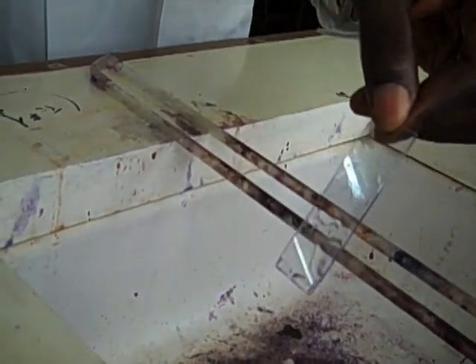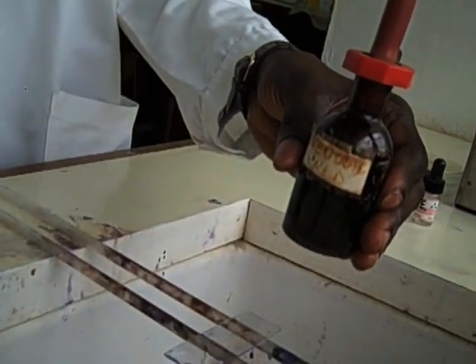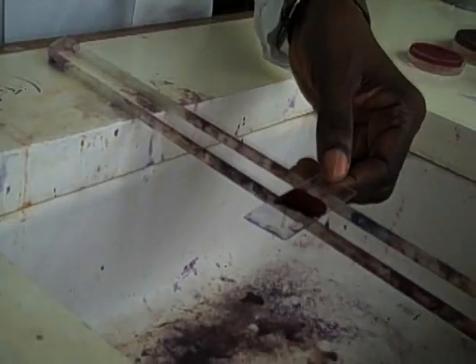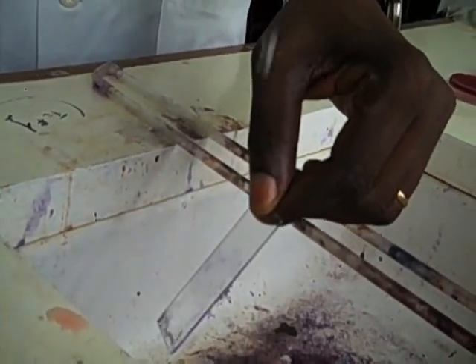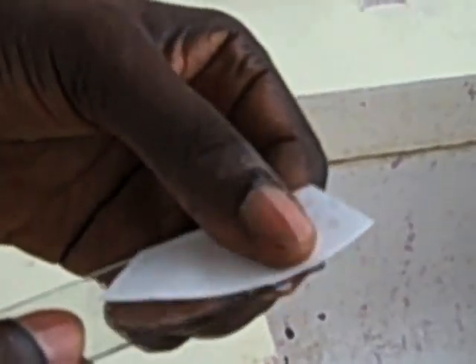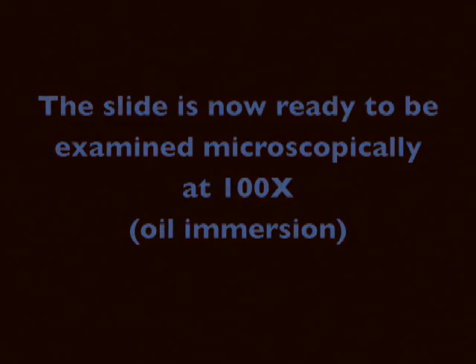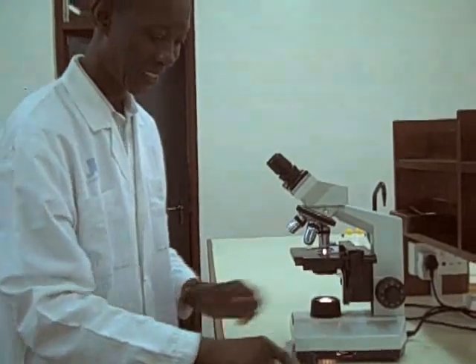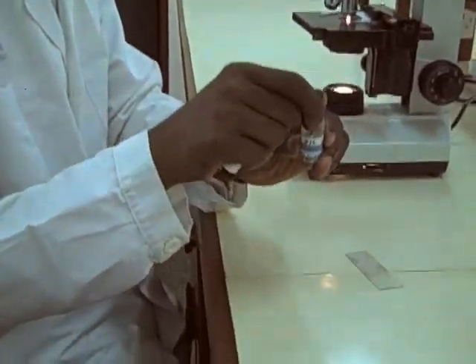Apply neutral red as a counterstain for one minute. Tip off the excess neutral red, wash with clean water, and blot it dry with a blotting paper — do not wipe. Place oil immersion on the slide where the smear is.